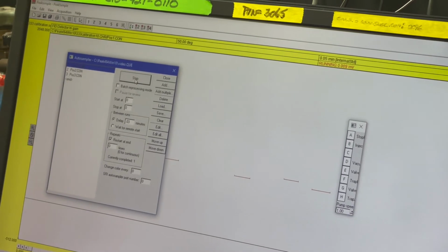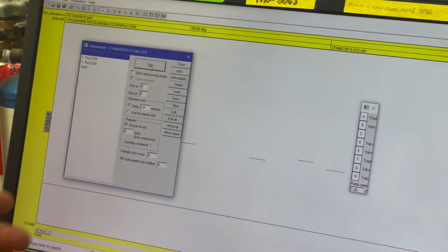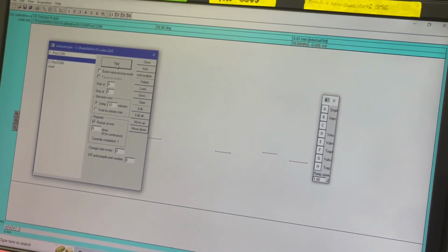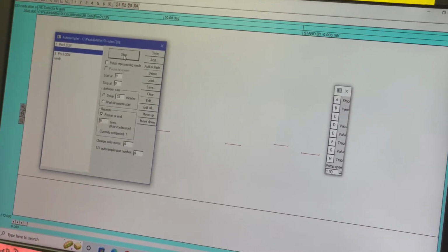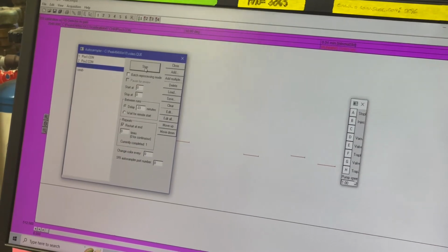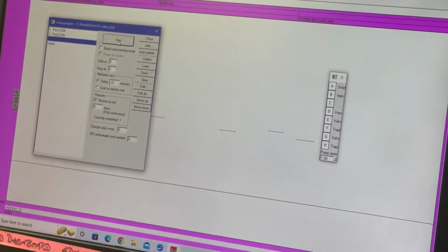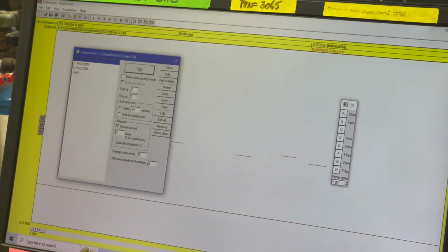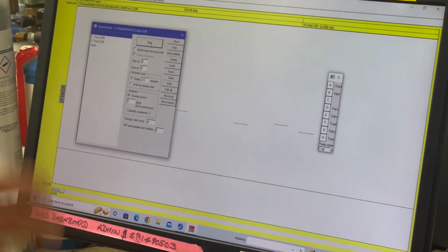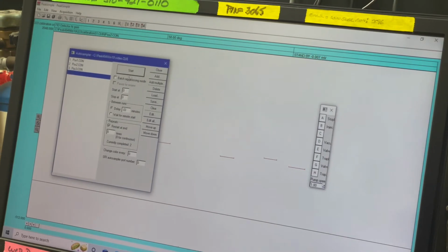So this can be very useful for lots of process kinds of applications. For instance, you're measuring the sample going into a filter, and then you're switching and measuring the sample going out of the filter, and then you're switching to a zero gas, and then you're switching to a calibration gas, and then you're going back to the inlet and the outlet and around the loop a million times. So it's very useful for applications like that where you want to have the GC do something that's different in each location, right? I'm going to stop this so it stops making noise at us.